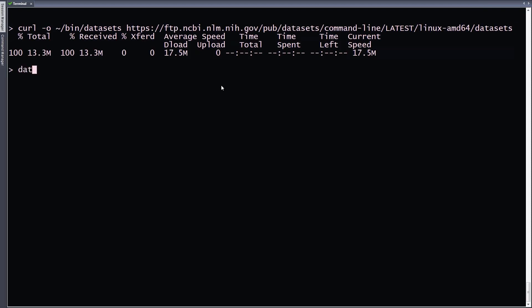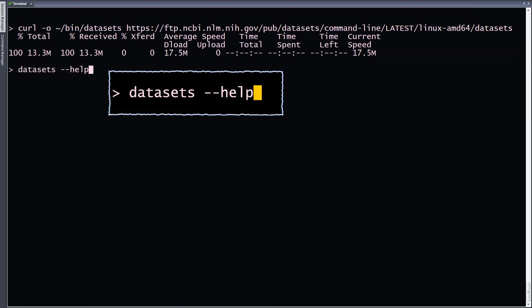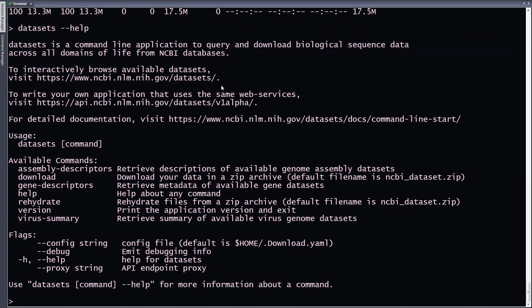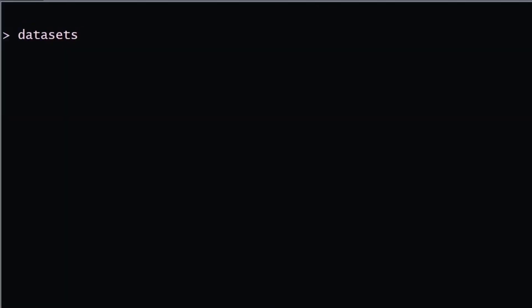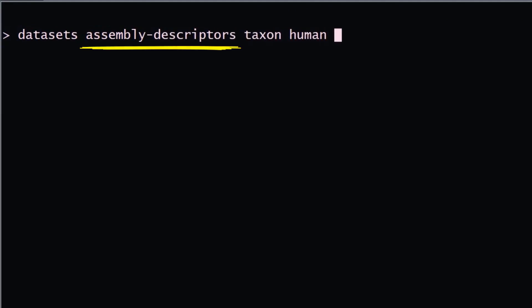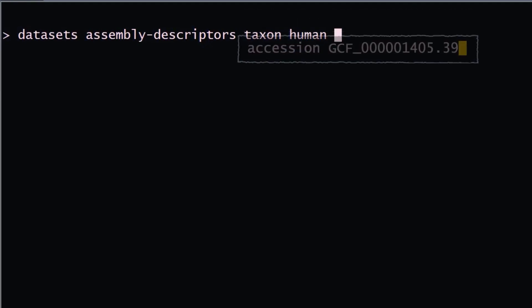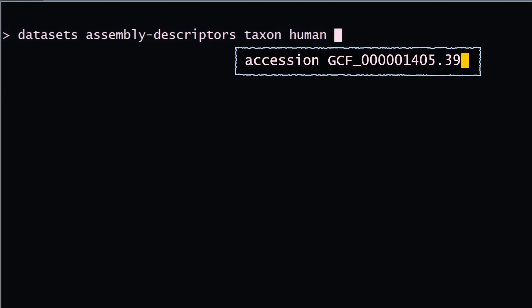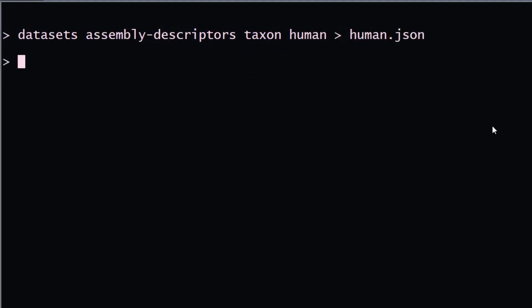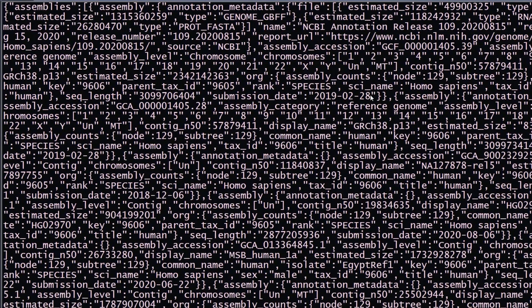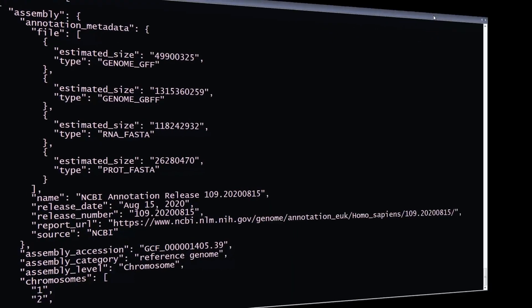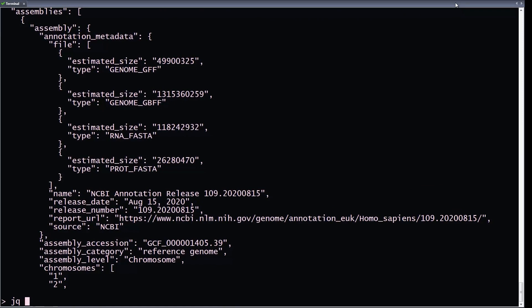Use datasets --help to see the Datasets command options. You can retrieve metadata on all human genome assemblies using the assembly-descriptors command. The taxon command takes scientific or common name, as well as NCBI taxonomy IDs. Or use the accession command to specify an assembly accession number. The assembly information is returned in JSON format, but you may want to compare just a few fields out of this file, so use your favorite JSON parser — here we are using JQ.